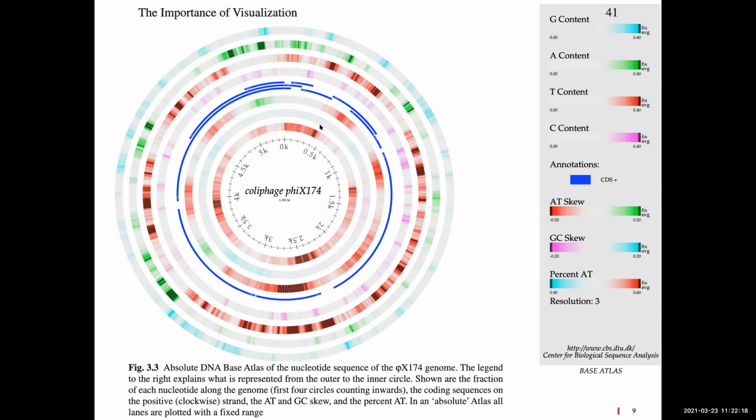And so this is looking at the skew a little bit of A's and T's. Here you have more T's and A's, or more G's and C's. That's looking at the skews, but the innermost is looking at AT content, and you see this is much more AT rich. Well, okay. Now, again, I'm going to back up here.